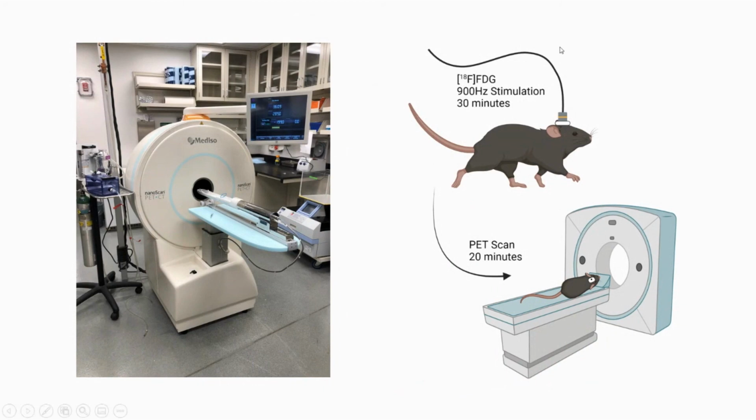you now have this radio-emitting molecule within that region. So if there's a really active region in the brain and it's got these little molecules, you can do that association. So you might deliver your ultrasound stimulation during behavior or what have you, and then you pop the animal onto this little board, send them into the PET scanner, and that will spatially localize where your radio emissions are coming from. I'm not going to go into how these work, but if anyone has questions on that, I can tell you about PET scans.